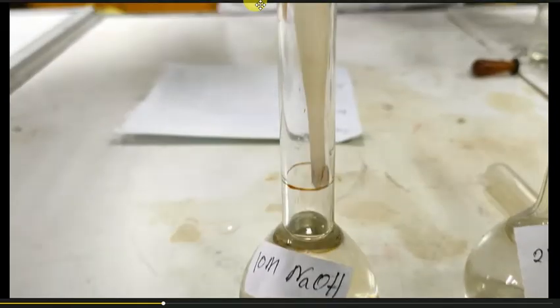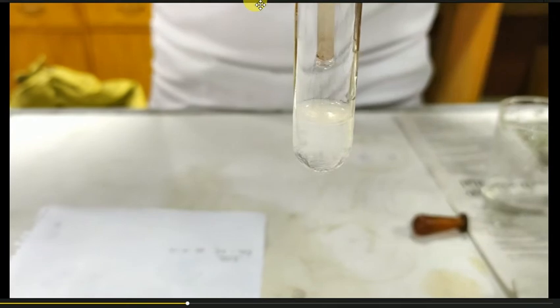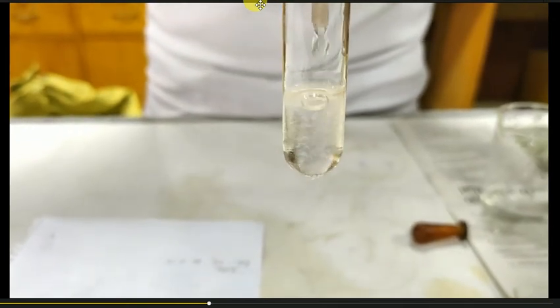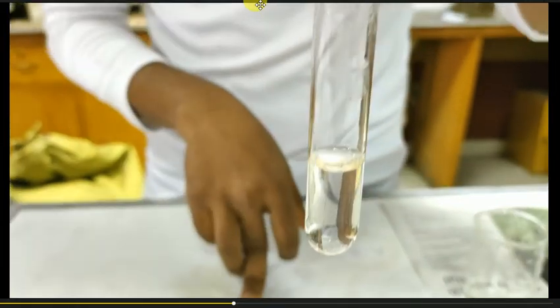In this case we are going to add concentrated sodium hydroxide so that the solubilization will take place at a faster rate. The precipitate will dissolve in this excess alkali, giving a clear solution. This is indicative of the presence of aluminum ion.